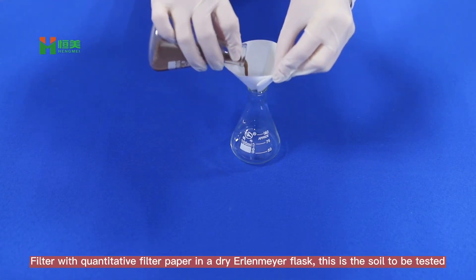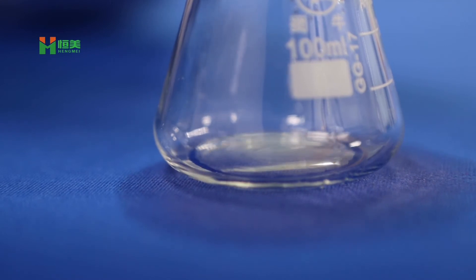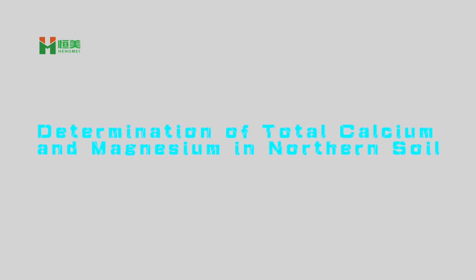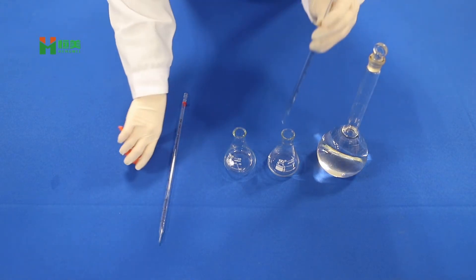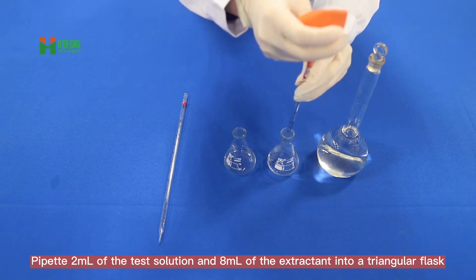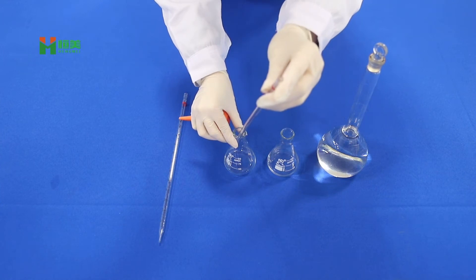Filter through quantitative filter paper into a dry conical flask — this is the soil test solution. Pipet 2ml of the test solution and 8ml of the extractant into a triangular flask.